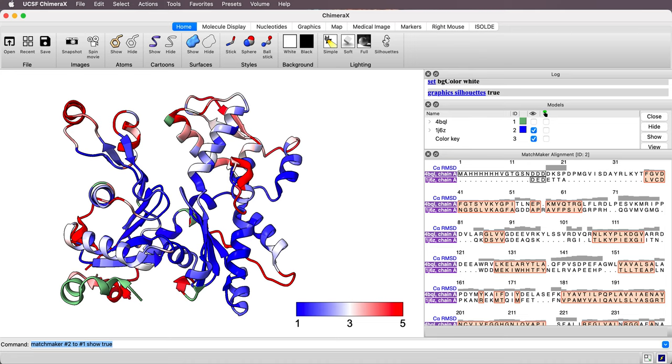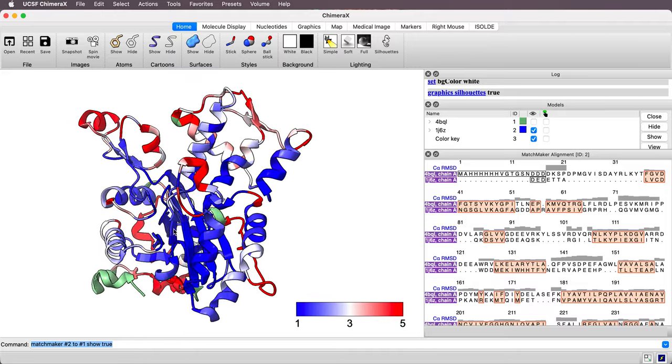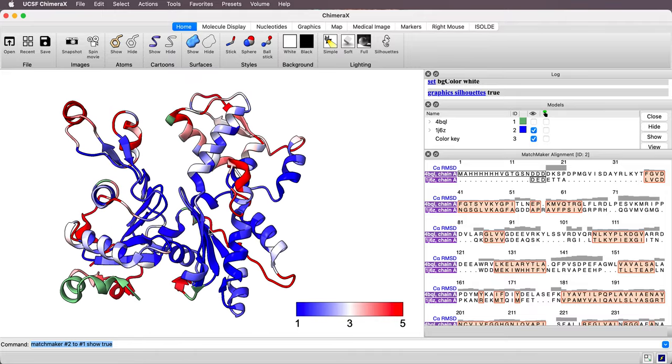A look at how to color a protein to show how far its carbon alpha atoms are from a similar protein that's been aligned to it. And this is what we're going to get here, this kind of coloring.